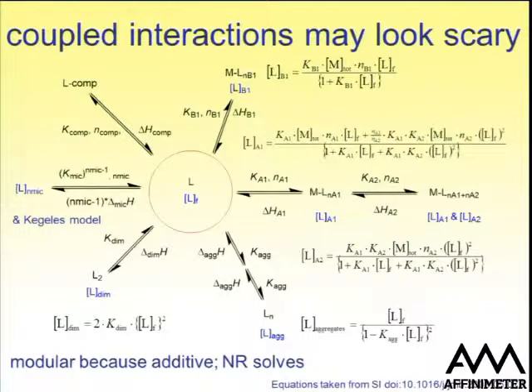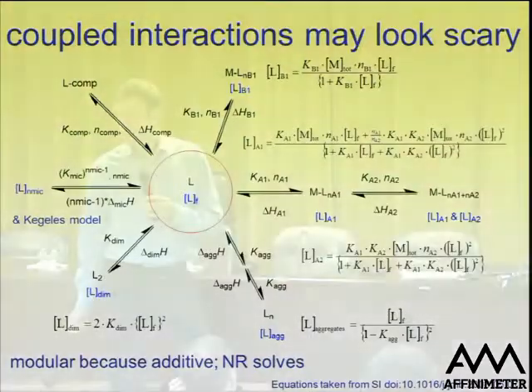What this picture shows you is that you have a whole series of different equations that you can switch on and off. So here we see an analysis that is completely based on the free ligand, and this free ligand has lots and lots of different choices. Which choices you offer the ligand in the analysis is basically up to you, in switching equilibria on and off. And I am happy that Adriaan mentioned consecutive binding models.